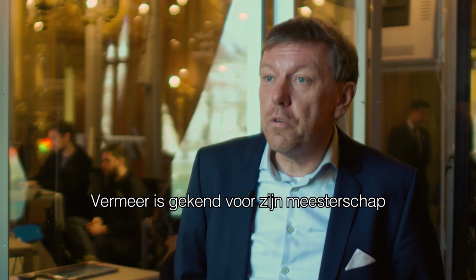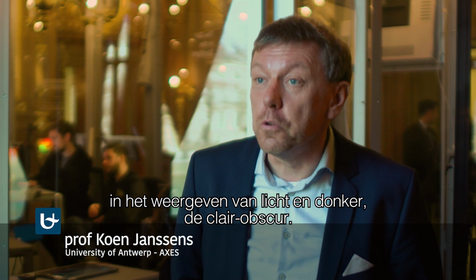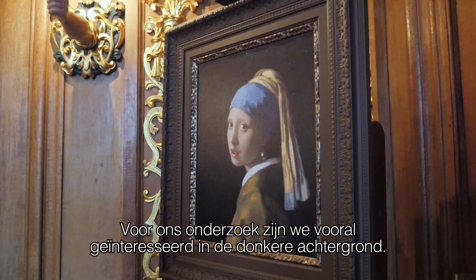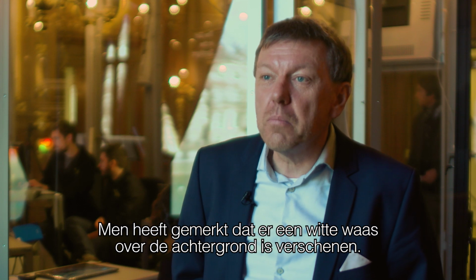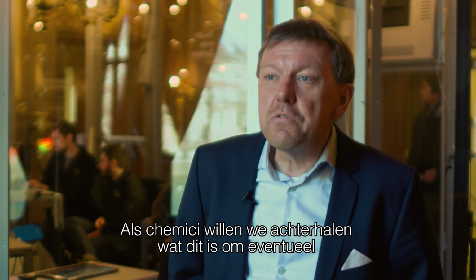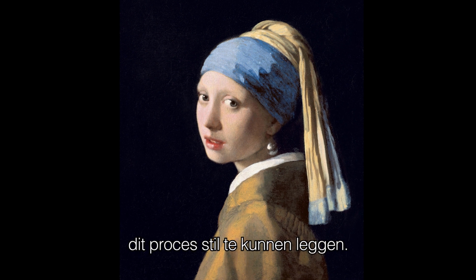Vermeer is known for his mastery of light and darkness, of the clair-obscur as it's called. So in this case here, what we are particularly interested in is the dark background. A white haze has appeared on the surface of this dark background, and as chemists we try to understand what it is, maybe as a means of stopping this process.